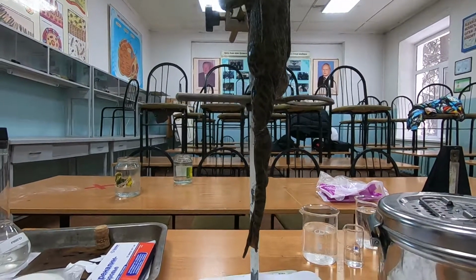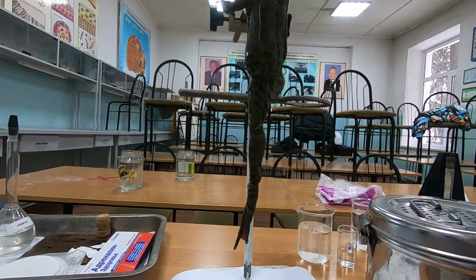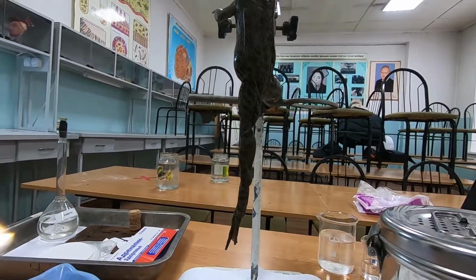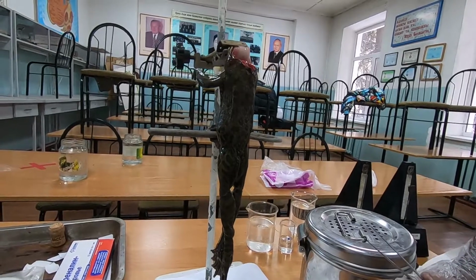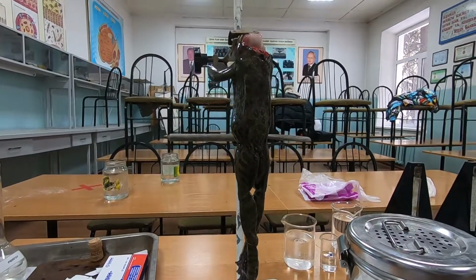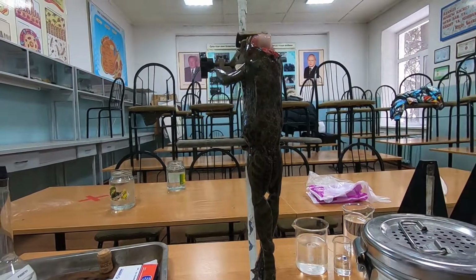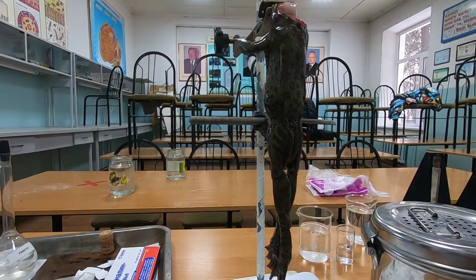That's after about 10 or 15 seconds. Yes, it took about 12 seconds to have the reaction when 1% concentration of sulfuric acid is applied between the legs of the frogs. Okay, that's to show you the reflex.